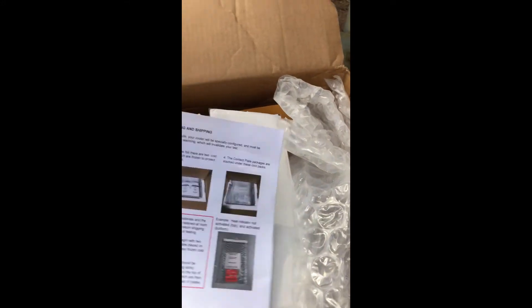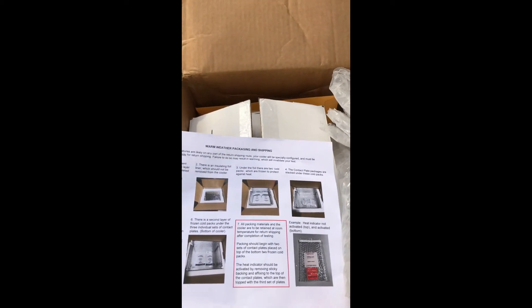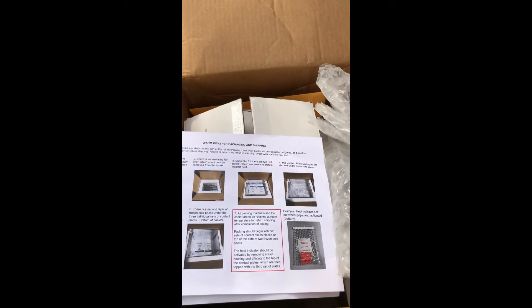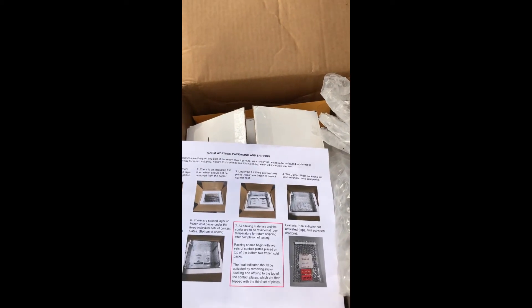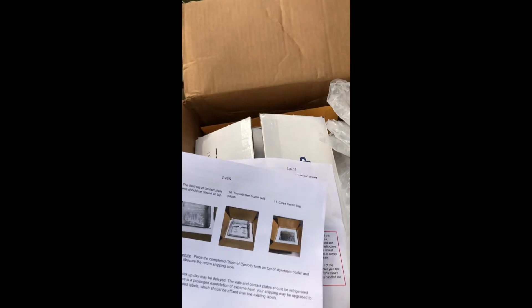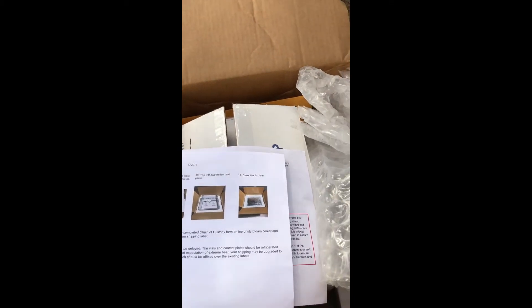Next we have the unpacking instructions, and they note warm weather shipping packaging as well, and what's inside. The key thing is the agar plates for the glove thumb fingerprint testing. Please read through all the instructions — it's both sides — as you're unpacking to make sure that you've unpacked everything correctly and have stored it appropriately for your use.